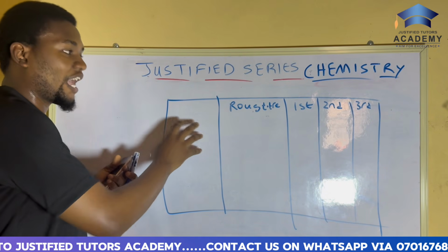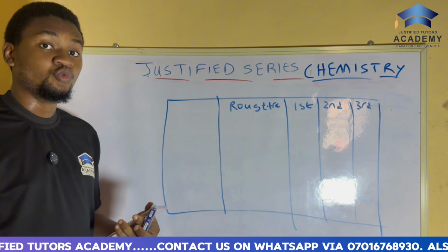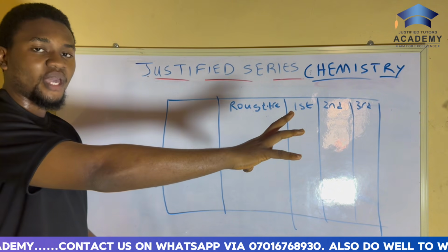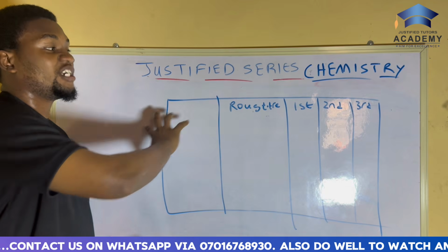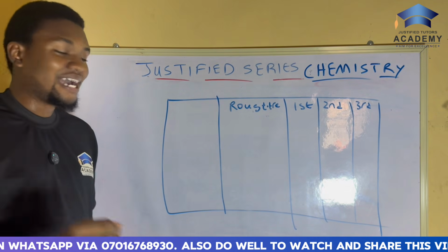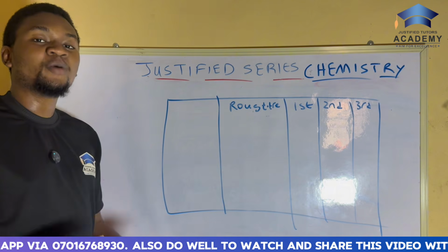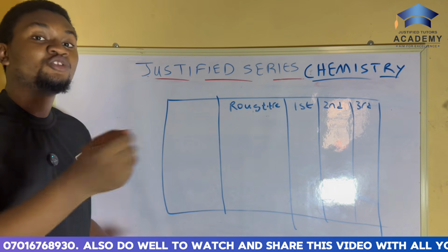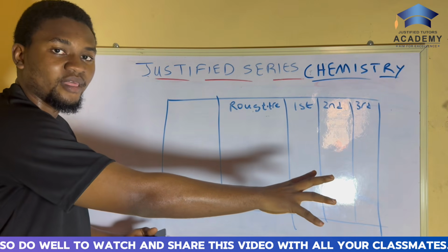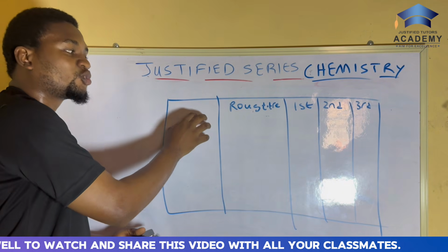This titer value, everybody in your school that is doing the WAEC will carry out this practical. The answer you get must not be different from the answer your teacher will get, because your teacher will also provide his own table. So your answer must correlate to your teacher's own.